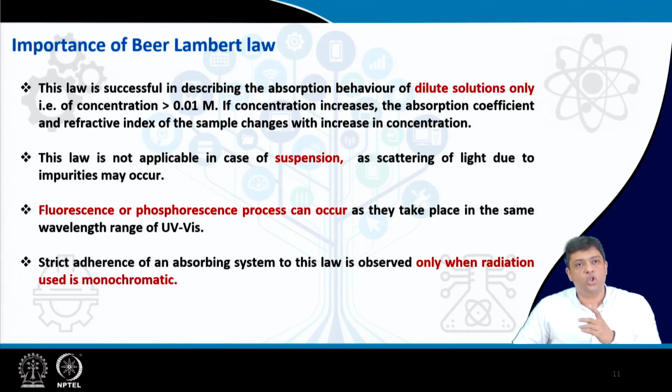The law is not applicable in the case of suspensions, as scattering of light due to impurities may occur and the whole process is much more complex. In addition, fluorescence or phosphorescence processes may occur as they take place in the same wavelength range of UV visible, and then the analysis of data becomes more difficult.